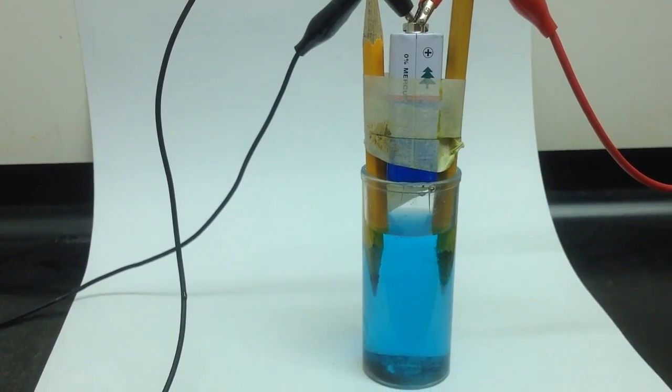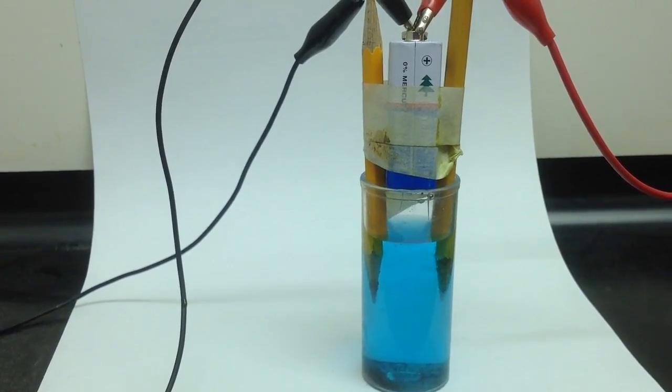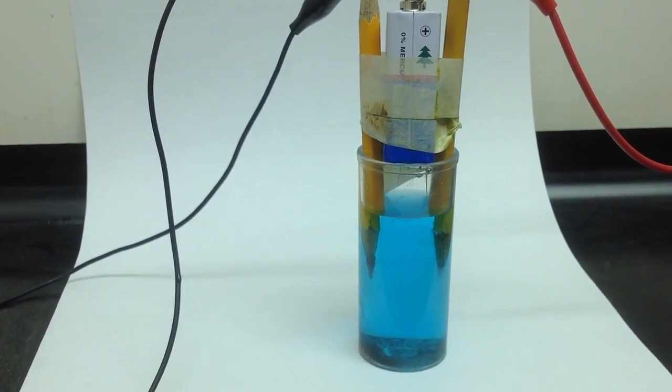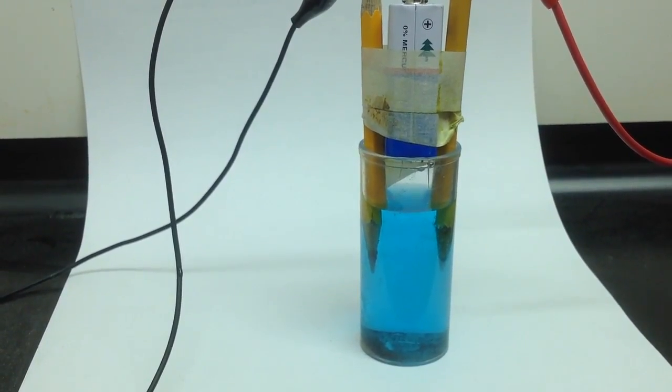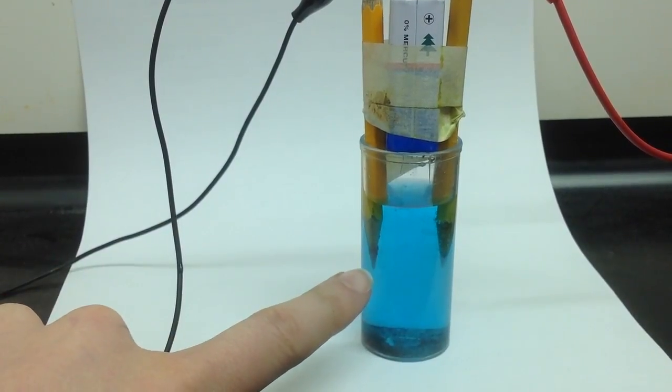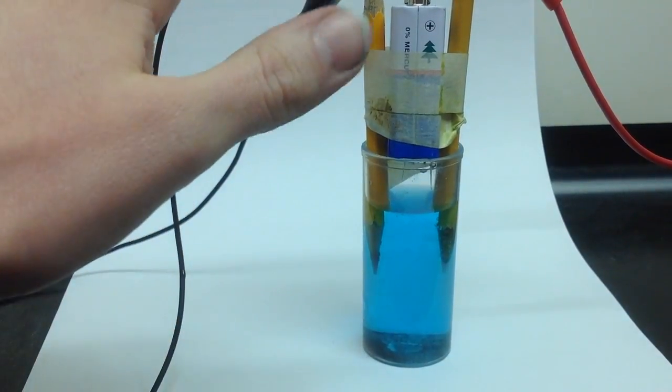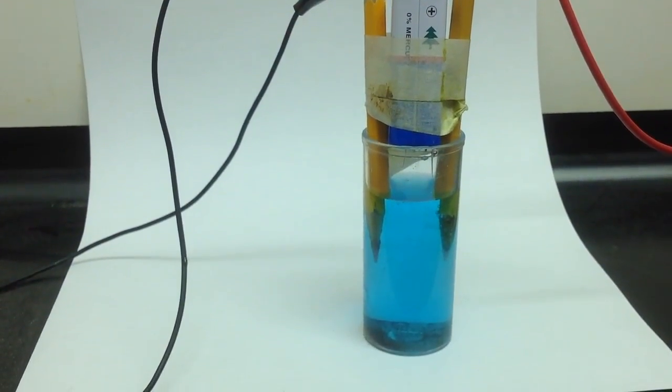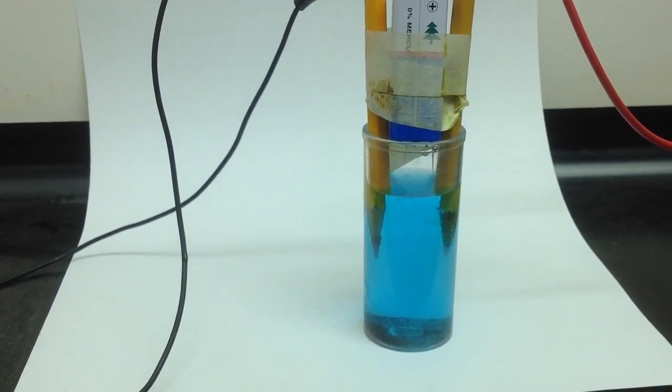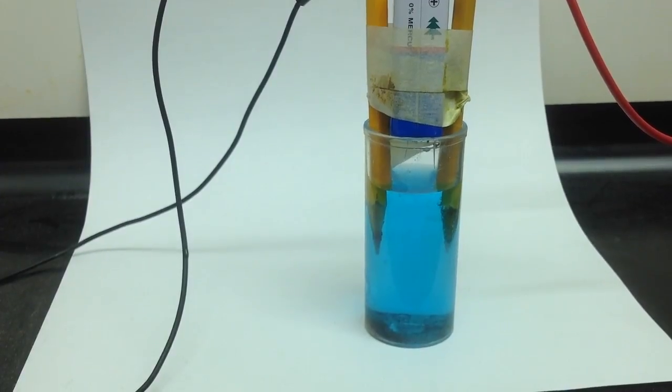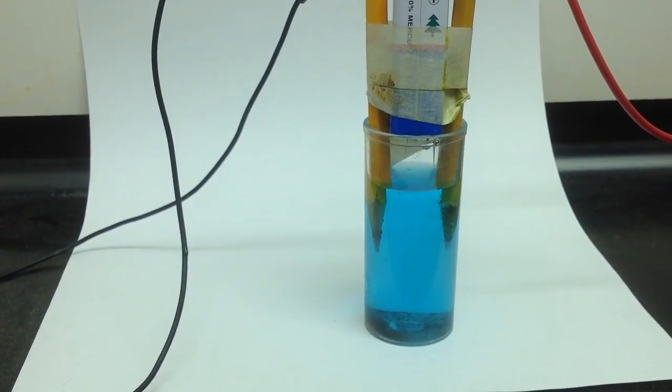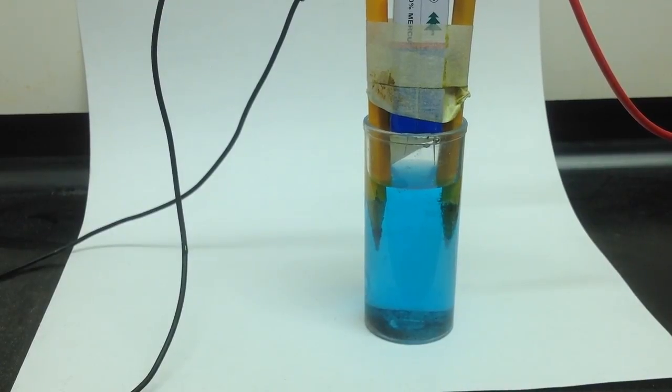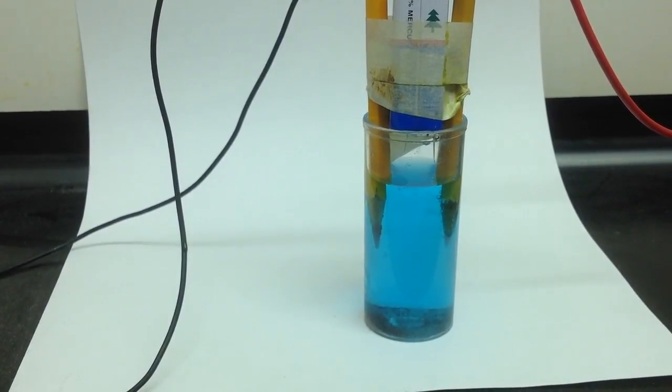If my chlorine is being attracted to the positive side of my battery, that means that my chlorine is a negative charge. Similar to my copper, it's accumulating on this side, which was attached to my negative end. So, my copper flakes, my copper pieces, are attracted to the negative end of a battery, while opposite charges attract. So, my copper is going to be positively charged.